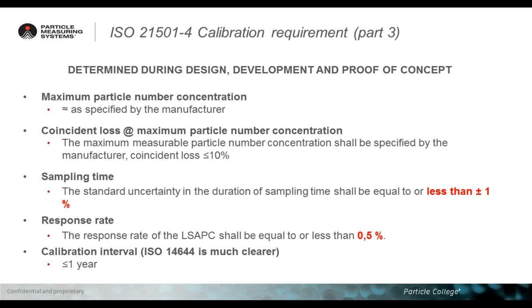So, of course, this is a risk, and you can mitigate the risk of having a particle counter out of specification, for example, by reducing the calibration time frame to 6 months. This may not be required for all the particle counters, but probably for those particle counters that are used in very critical areas, in the sterile area, ISO class 5, and so on. So please, just consider this as a possible alternative, as a possible solution to mitigate the risk of having an out of specification.